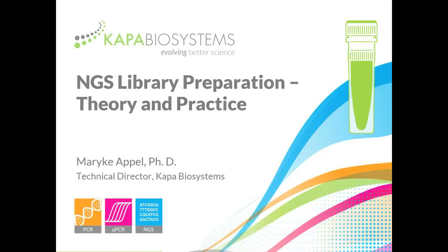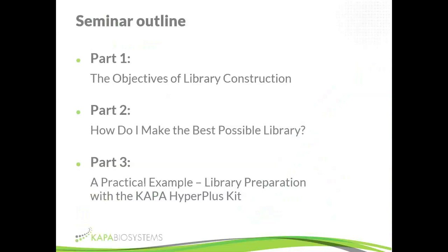So this presentation is the first of a three-part series which I've called NGS Library Construction Theory and Practice. And so in part one, which will take more or less an hour, we're going to step back a little bit, look at some of the high-level theory behind library construction to sort of provide context for what comes next.